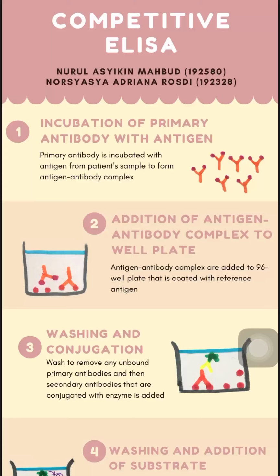Competitive ELISA, also called inhibition ELISA, is used to measure the viral antibody or viral antigens present in the patient's serum by using two specific antibodies or antigens that will compete with each other to bind to target antigens or antibodies respectively. In this assay, the signals are produced from the reaction of substrate and enzyme conjugated secondary antibody. This reaction produces color changes or light signals that could be measured quantitatively.